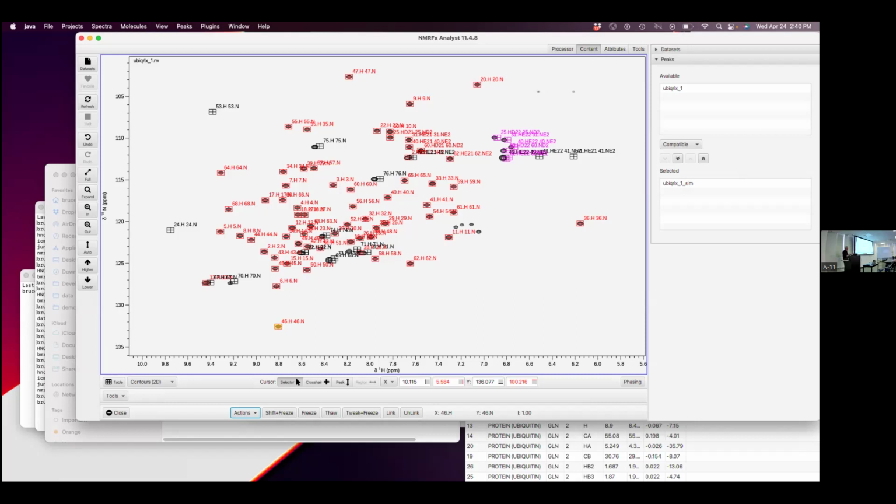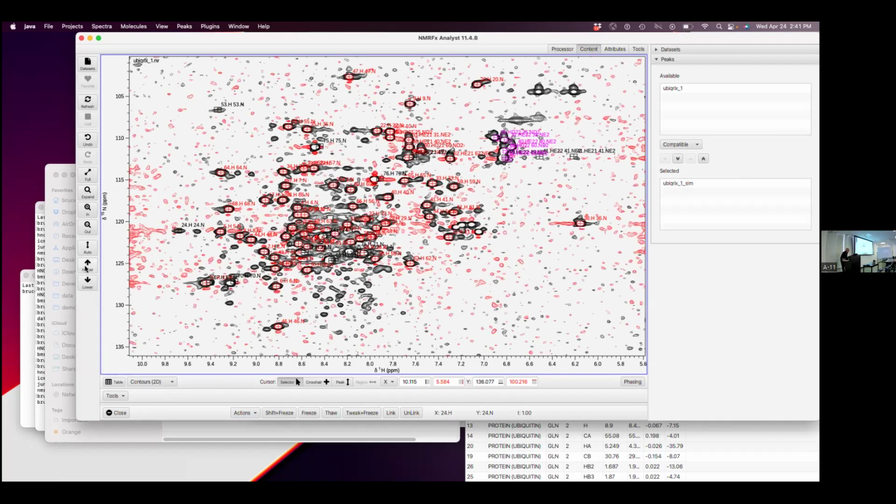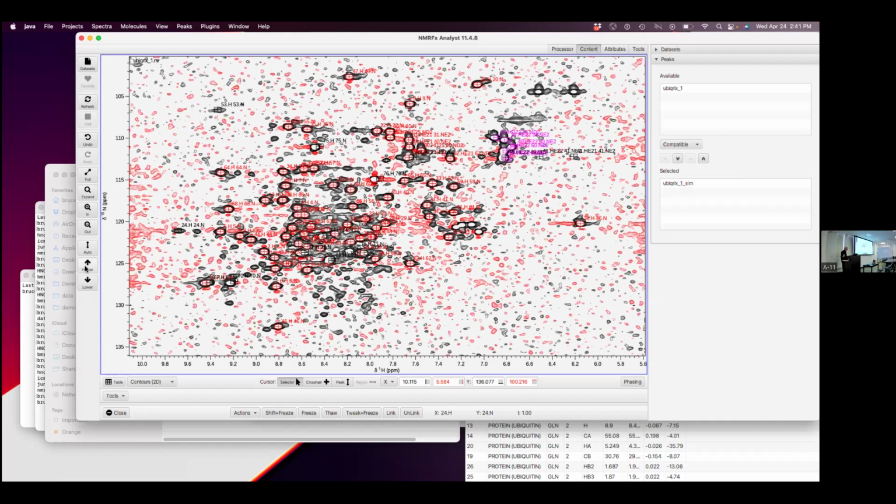If you lower the contour, there's a couple of boxes that don't show a peak. Yeah, lower the contour. So maybe this guy, and up here maybe this guy. So maybe we want to do that. The problem is, if I got that low and did the whole peak picking, I'd have so many things. Right. And then you raise the contour a little. No, the other way.